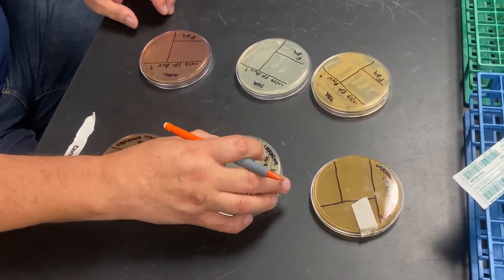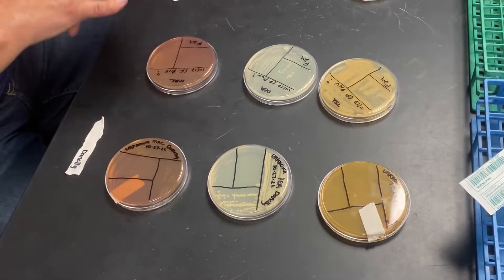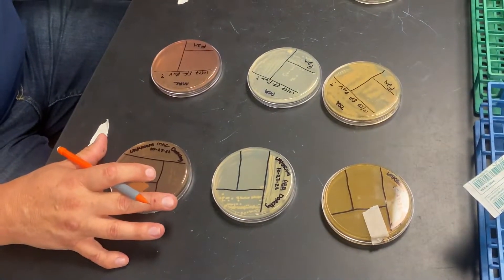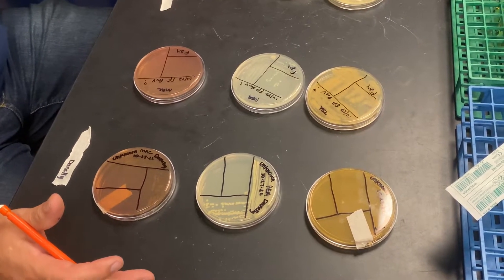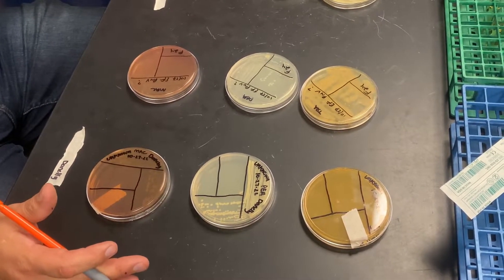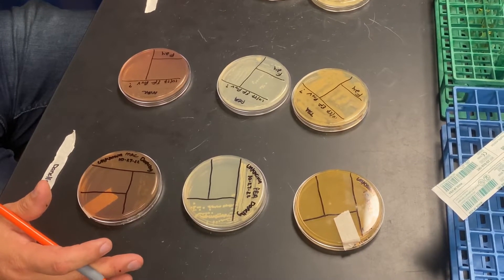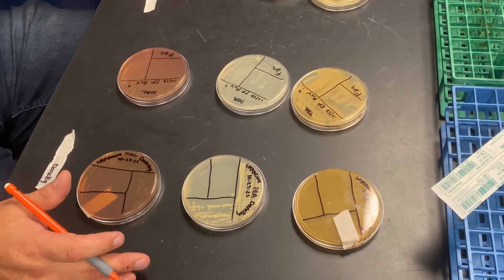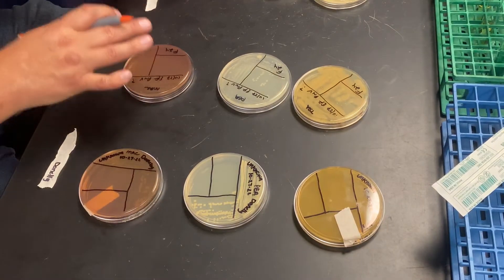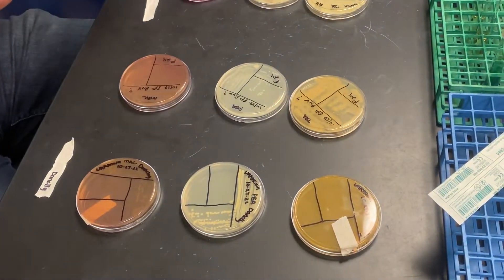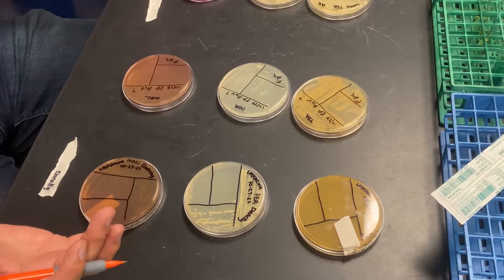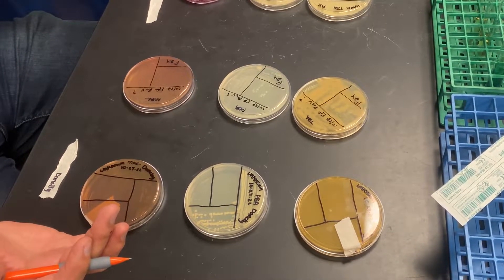Now the gram negatives are easy, right? They're growing on MacConkey and you know they're gram negatives. So all you really have to do is put them into a battery of tests that we know as IMViC. So everybody should put their gram negative from MacConkey into EMVIC. But the gram-positives are a whole different ballgame. You're going to have to tell me what the morphology is before you can figure out how to identify it.